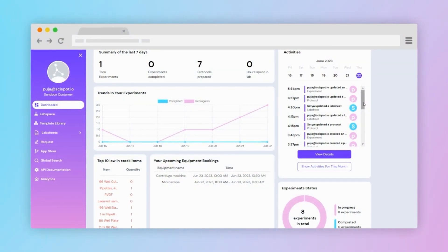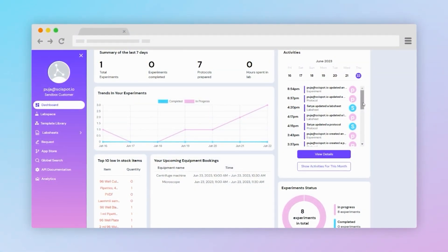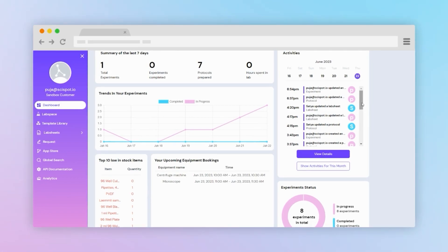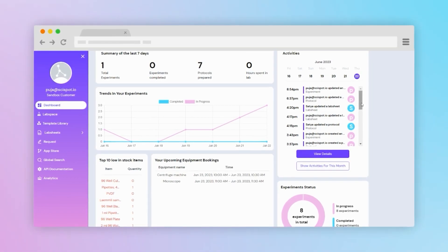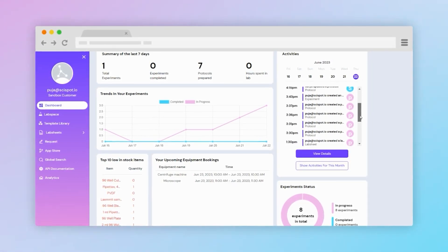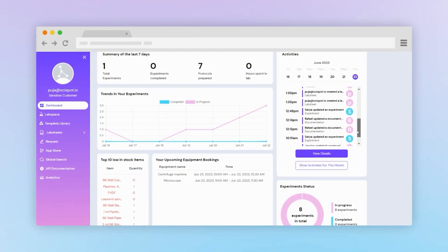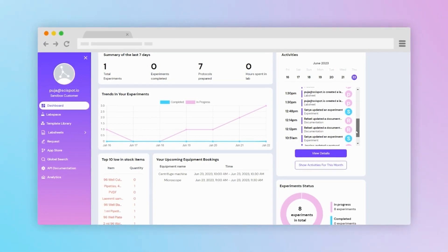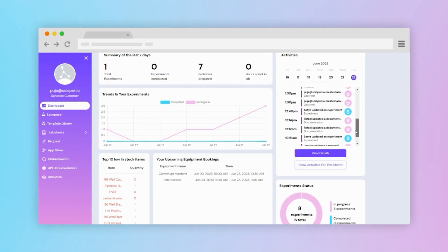The dashboard is a real-time display that provides users with an instant overview of their inventory status, including low stock alerts, upcoming equipment needs, and activity logs.